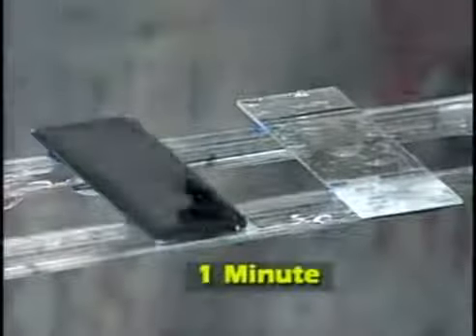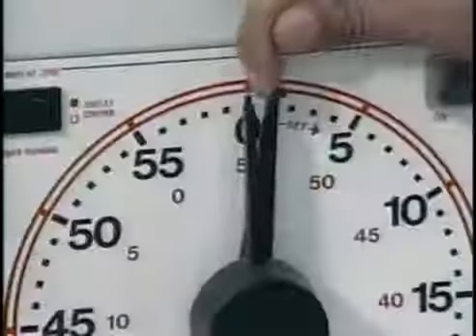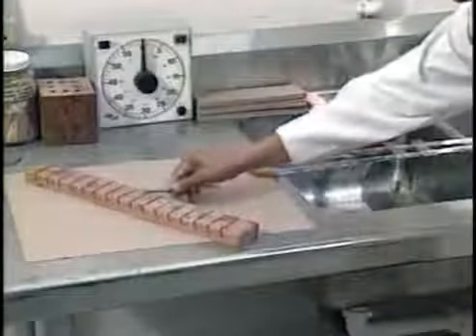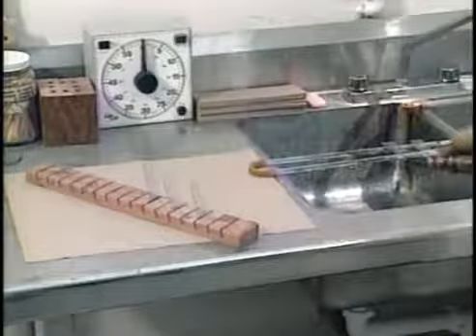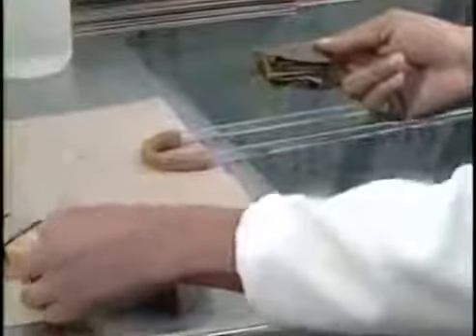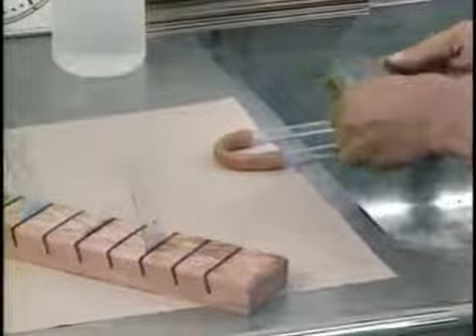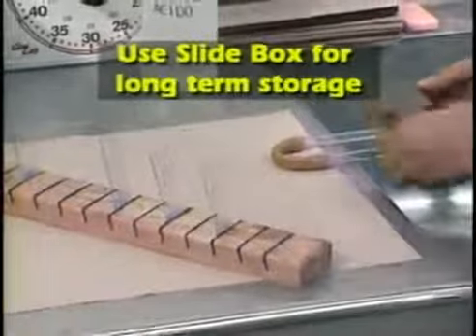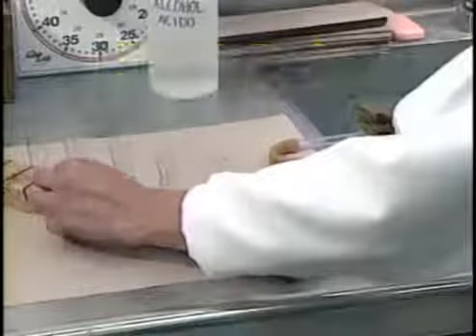Next, counterstain with methylene blue for 1 minute. Rinse again with a gentle stream of water and tilt each slide to remove excess water. Finally, tilt each slide and place in a slide block to air dry. Do not blot. After smears are stained, clean off the back of each slide if necessary with some alcohol on a paper towel. Do not examine slides until they are thoroughly dried. Cover the stained slides to protect them from sunlight, which can fade acid-fast bacilli.